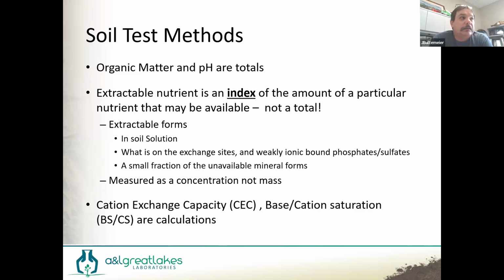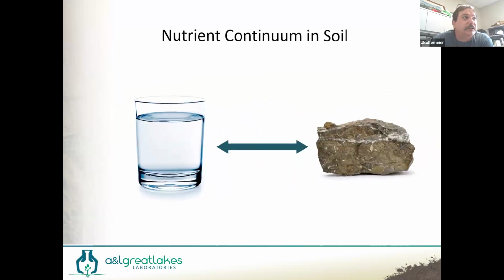They're impractical. We can get within a couple of percent accuracy with a calculation, unless something is really unusual or really out of whack. We just use the calculations. It's more cost effective in the long run. I won't get into researchers and engineers who will want to use absolute numbers, but we try to avoid those things in production ag. It just doesn't make sense.